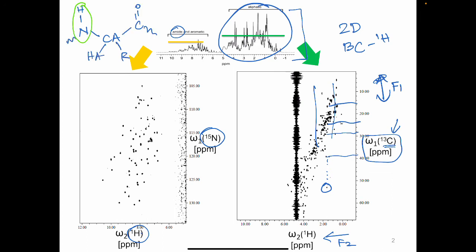This is the amide part of it, which is being plotted here, the amino protons that are present and resolved by the nitrogen chemical shift for the protein BPTI that we are trying to study using solution-state NMR spectroscopy. I hope this helps you understand how a two-dimensional spectrum would help you alleviate resonances that are severely overlapped in the proton NMR spectrum.